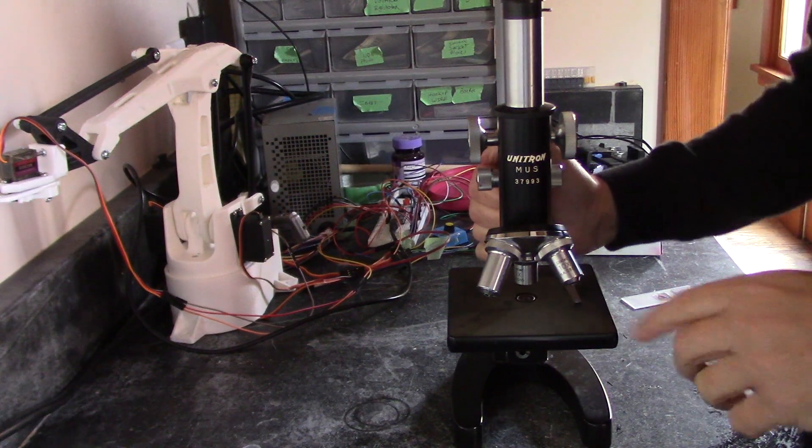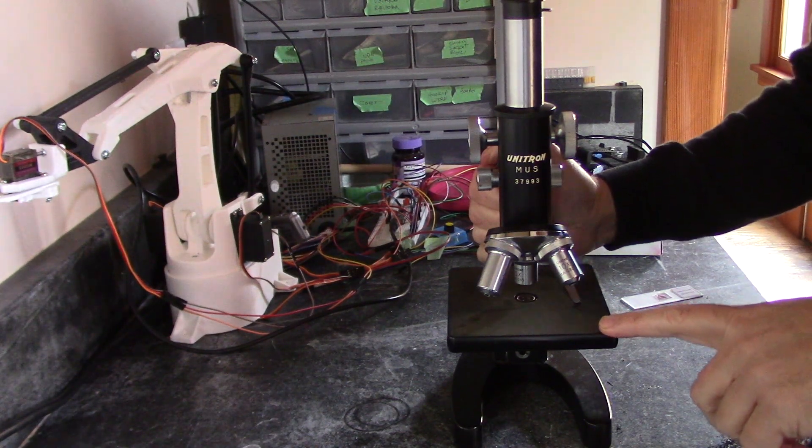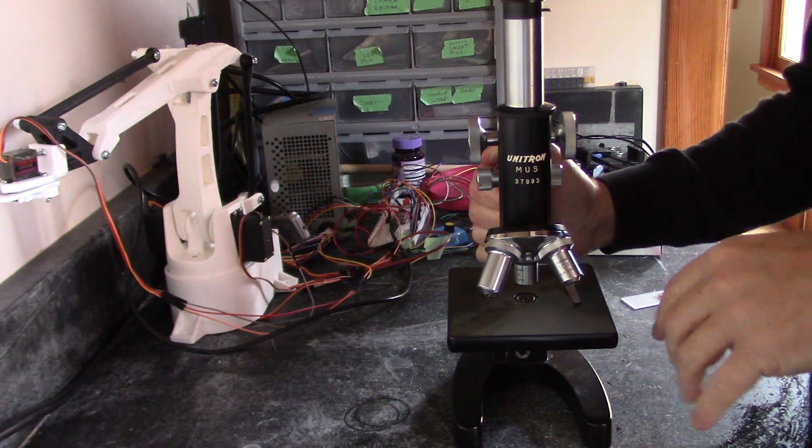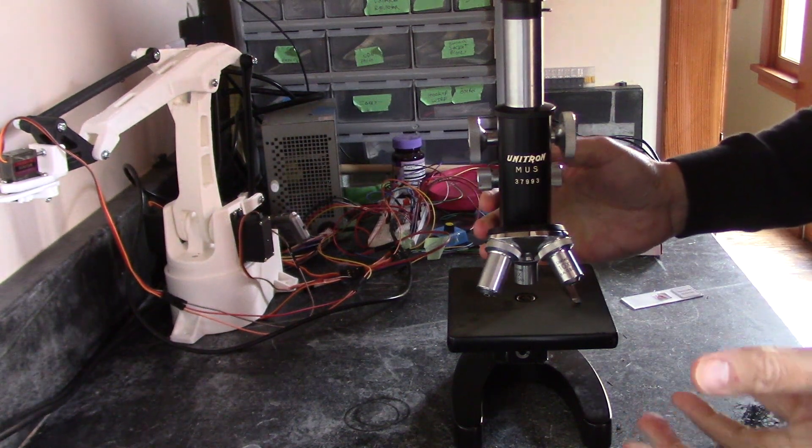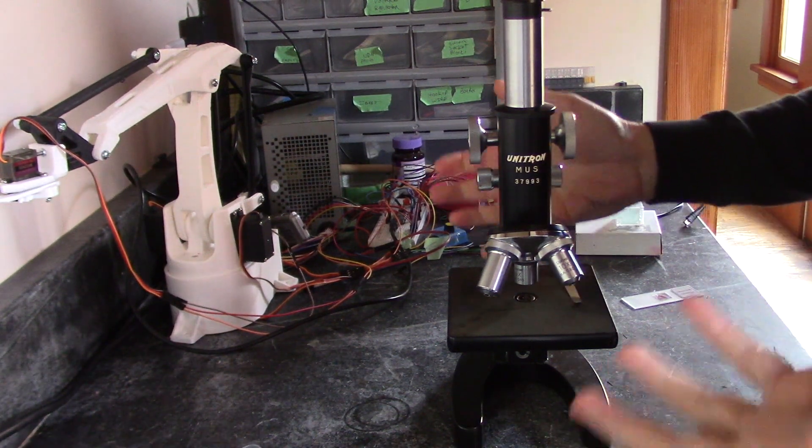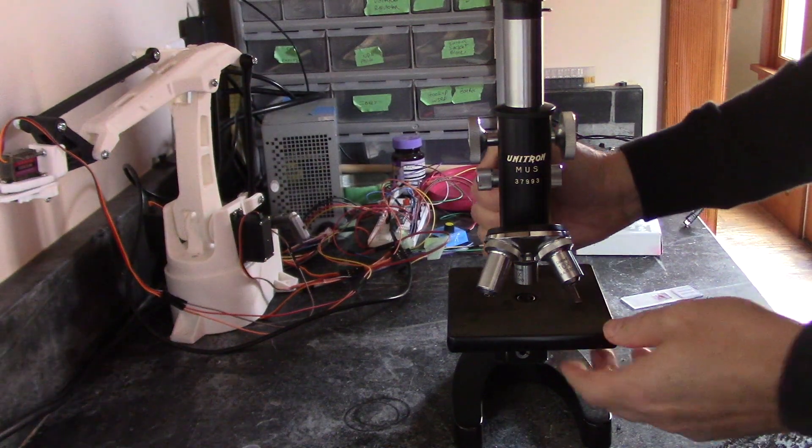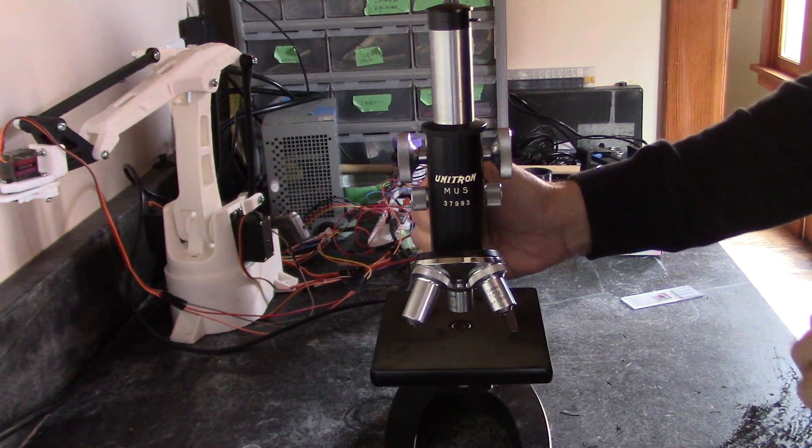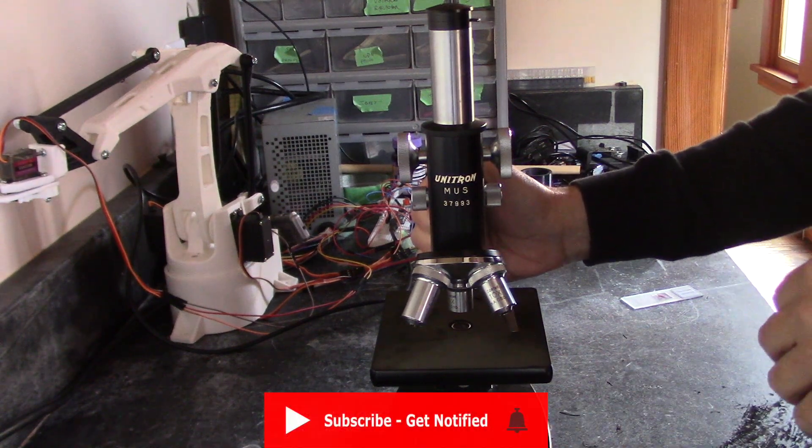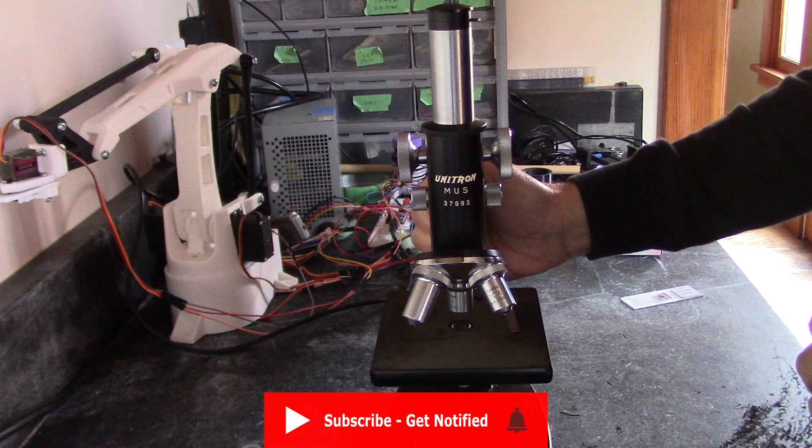Today I wanted to show you this microscope that I picked up. I got this at a thrift store and this is a vintage microscope. I don't know how old it is, probably 30 years, not sure.